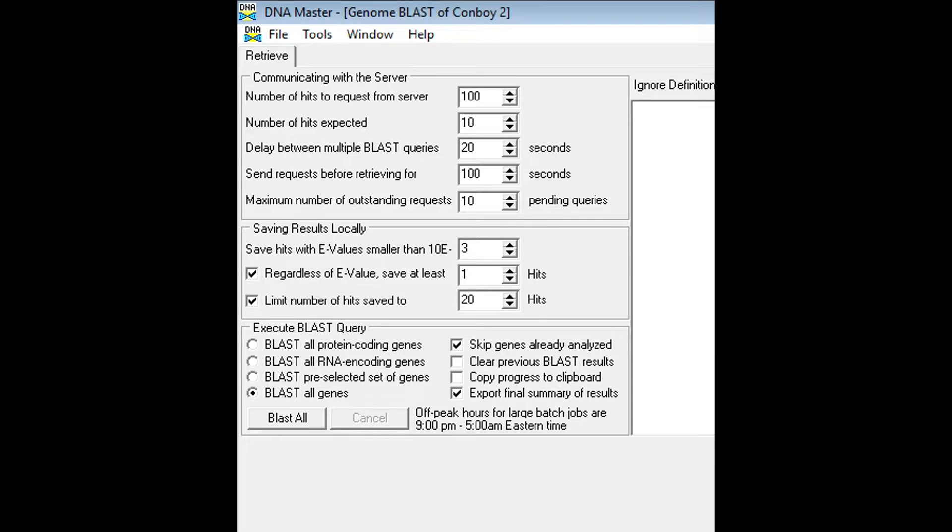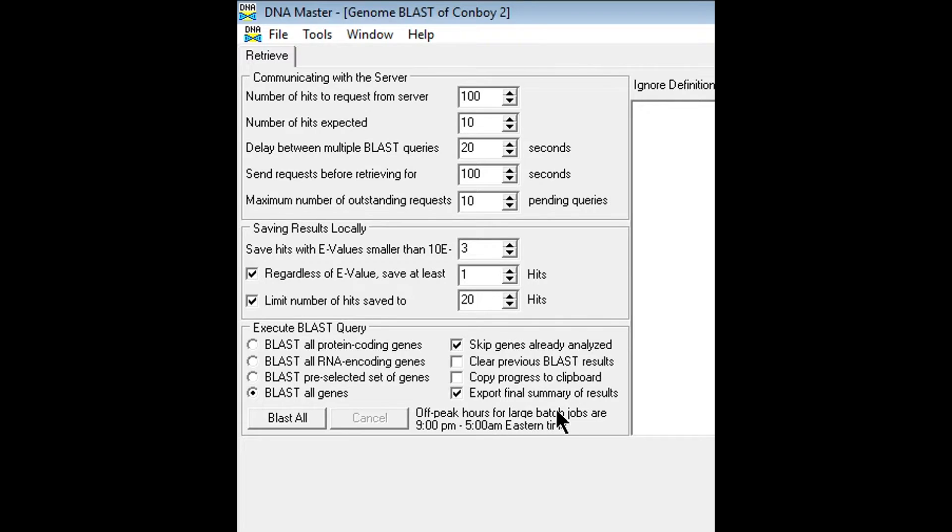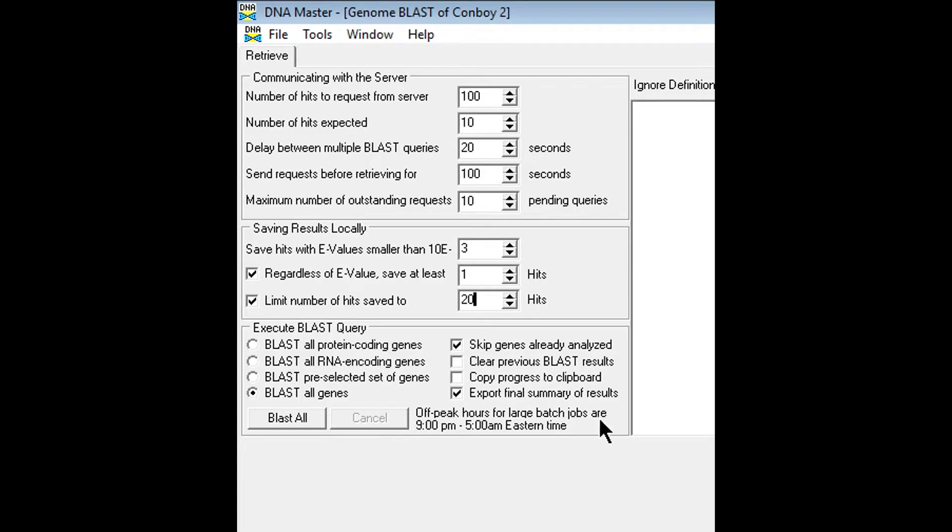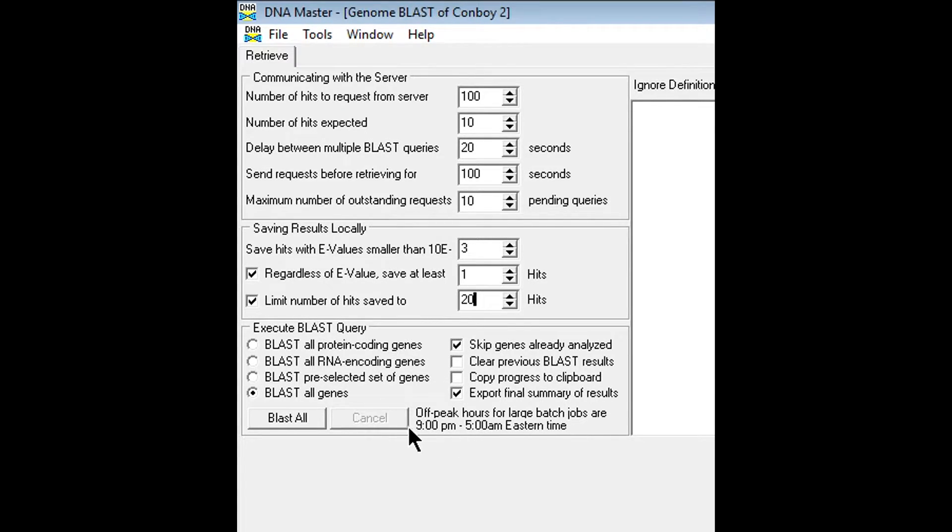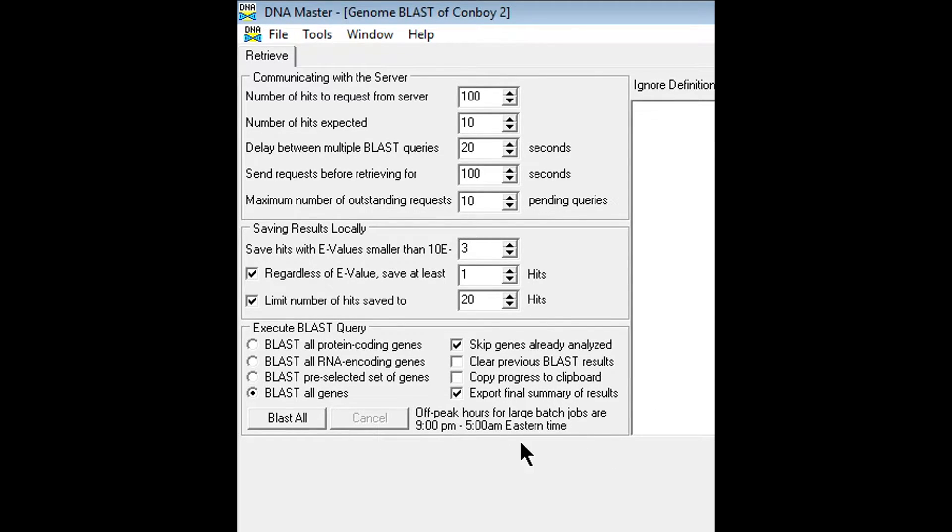The next thing I want to point out to you guys is this little box of text here. Off-peak hours for large batch jobs are 9pm to 5am Eastern Time. NCBI actually alters some of the parameters for larger blasting jobs. This would be considered a larger blast job because there's over 100 genes to blast.